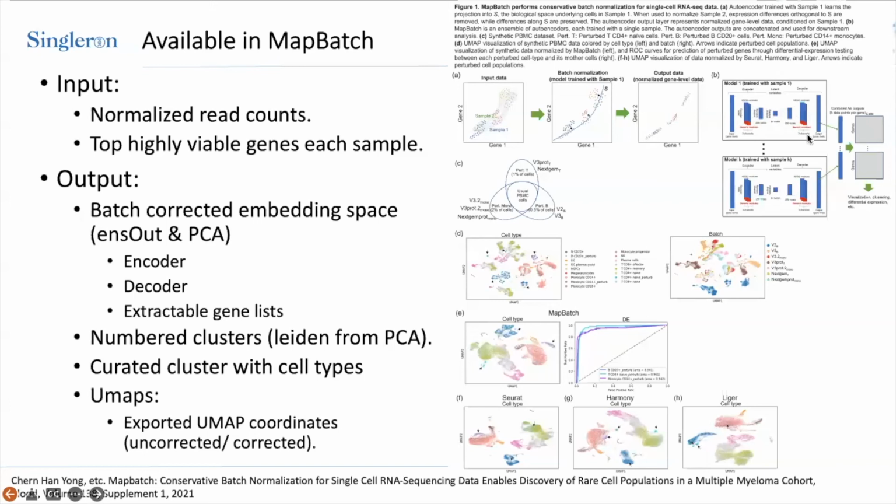The next step is to concatenate the learnings from a small number of training samples, so that later when the test data comes in, it will be projected to, for example, the two or three training samples, and then the corrected counts will be obtained. The downstream differential expression can be calculated from there.